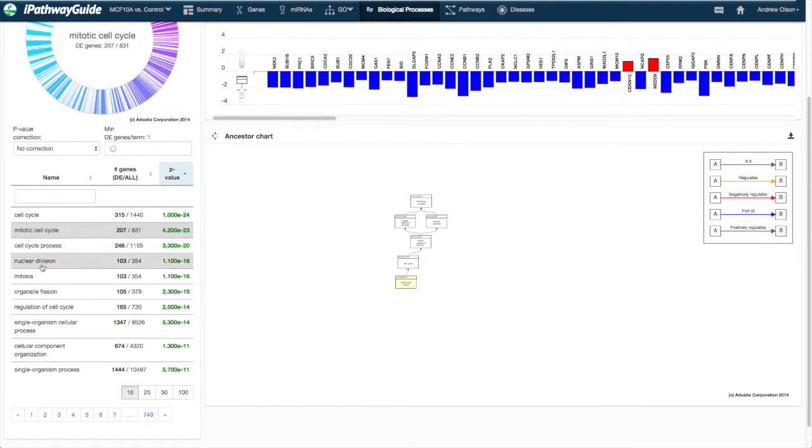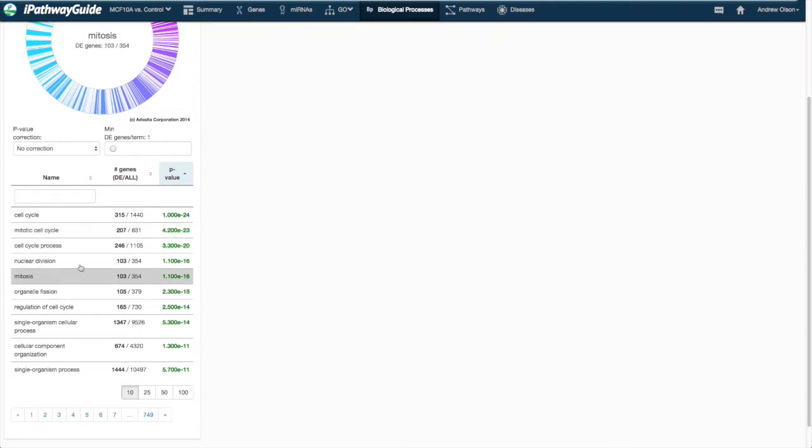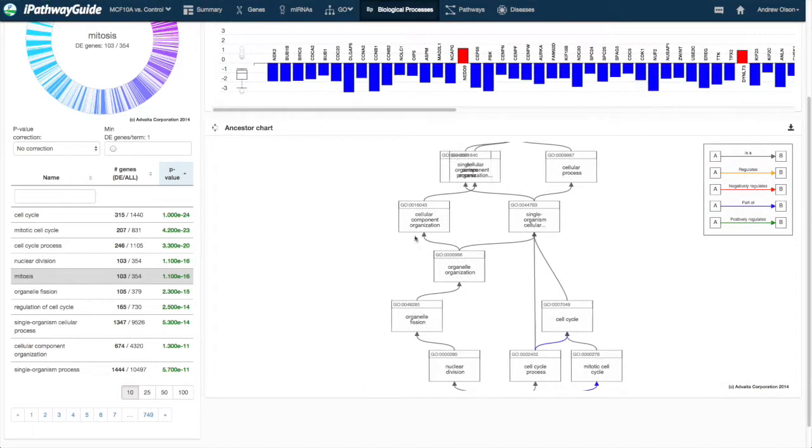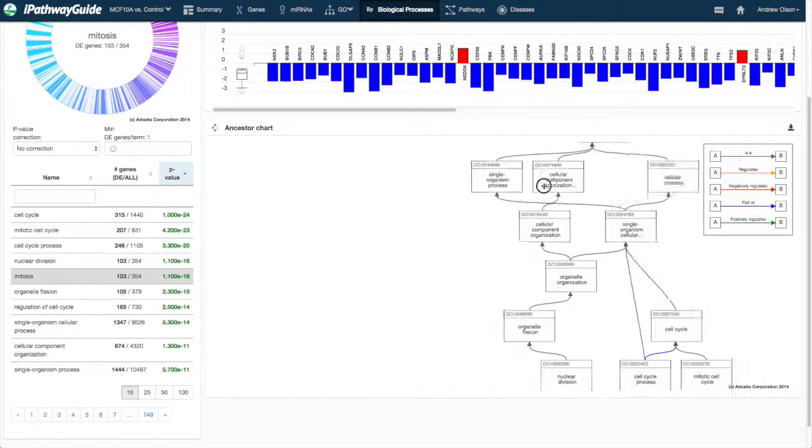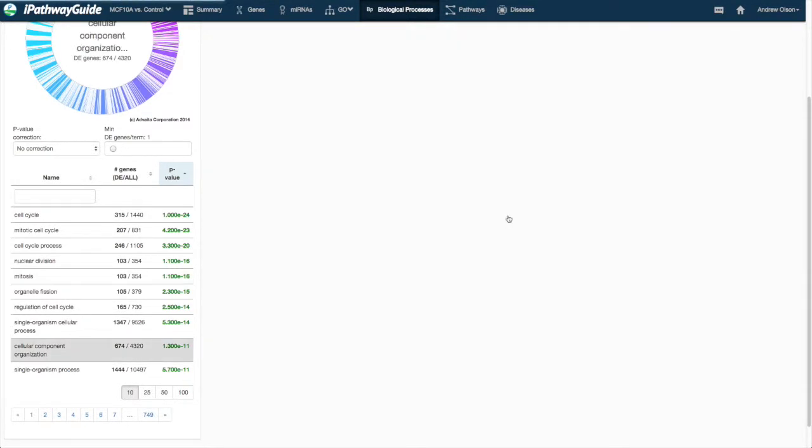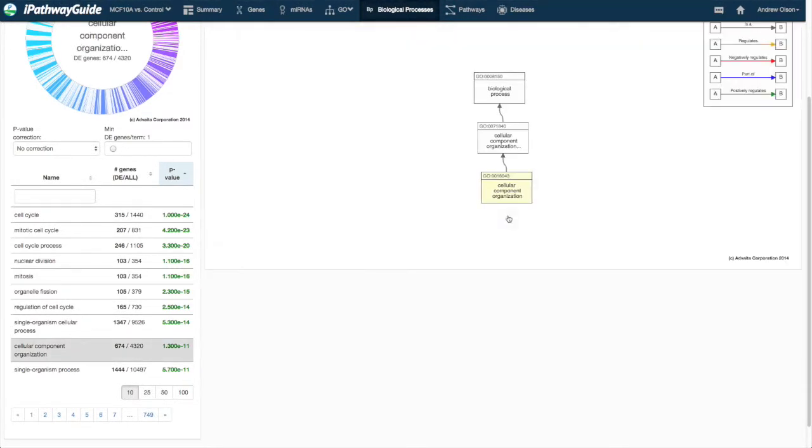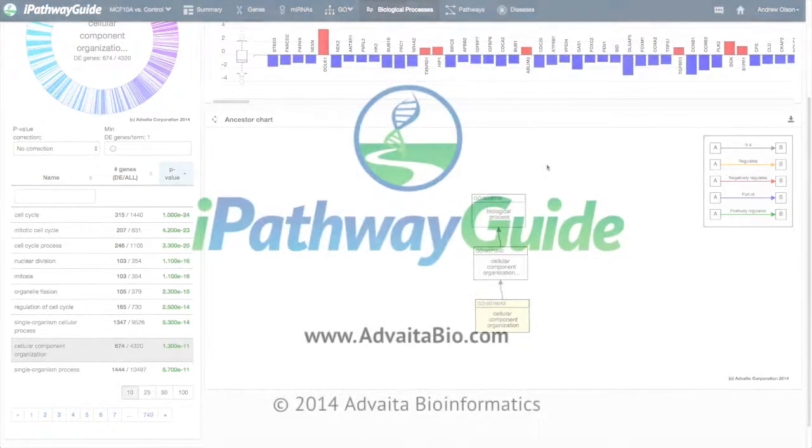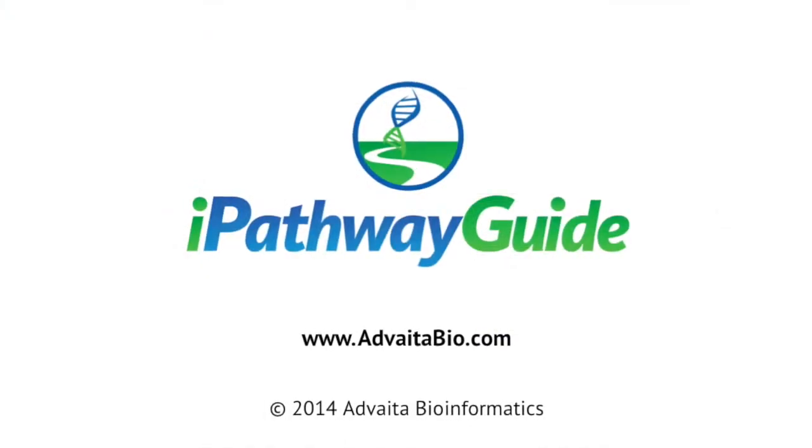You can zoom, drag, and otherwise manipulate the chart. Clicking on any one of the headers will take you to the chart for that term.